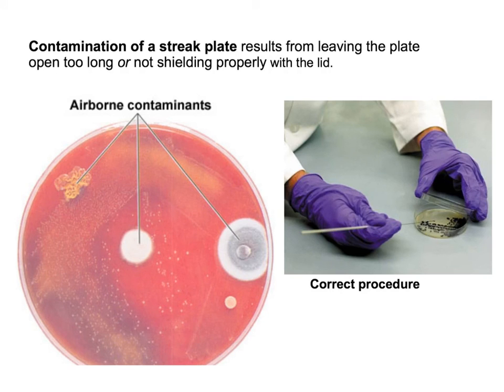You'll notice that I keep saying that we need to have a sterile agar plate. We want a plate that is free of contamination. You'll notice that this one right here has contamination. It has some mold over here and some airborne contaminants.